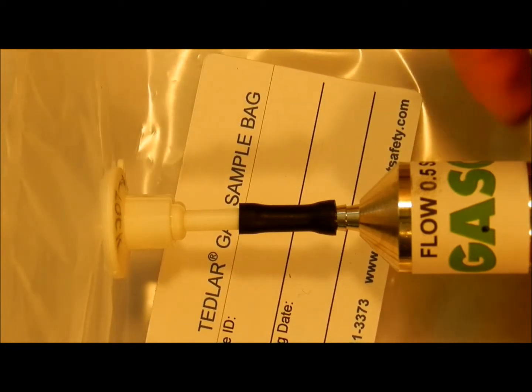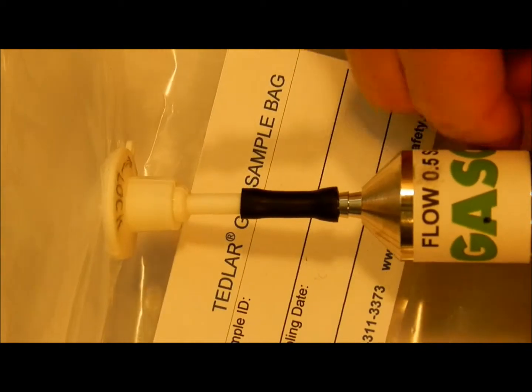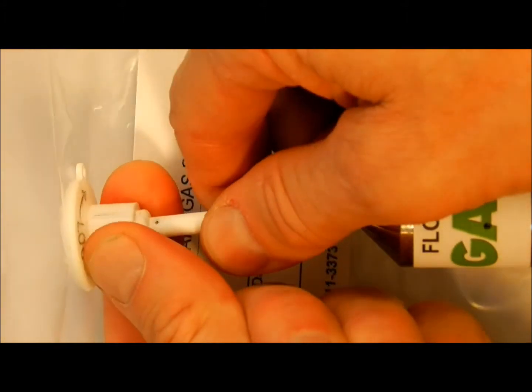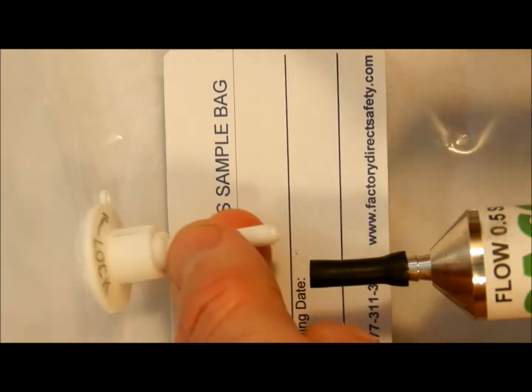When the bag filling is complete, turn off your gas source, pull the valve out and rotate clockwise to lock the valve. Remove the gas supply as necessary.